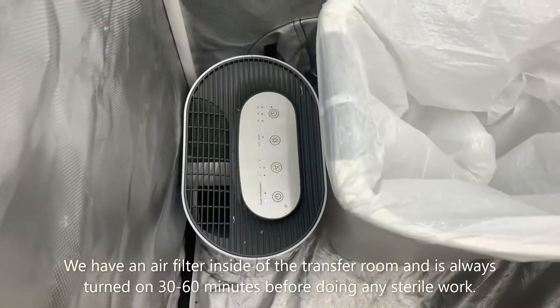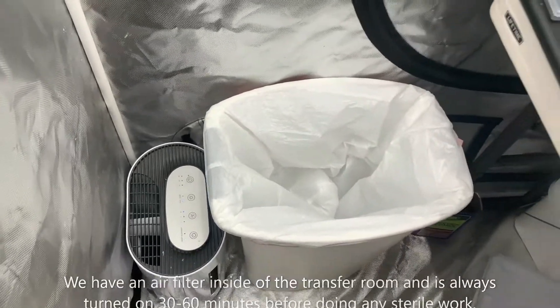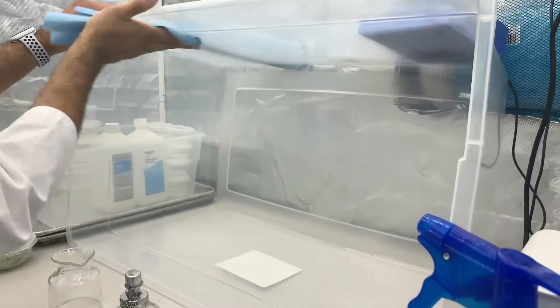Since we don't have access to a laminar flow hood, we turn on our air filter inside of our transfer room around 30 to 60 minutes before any sterile work begins.